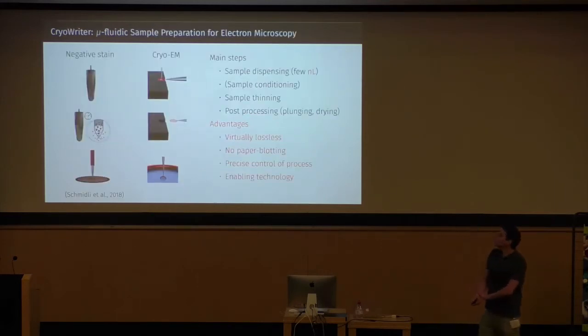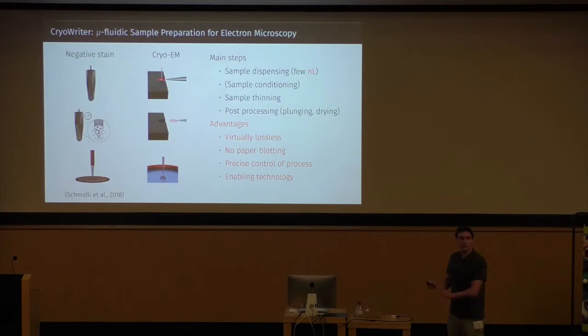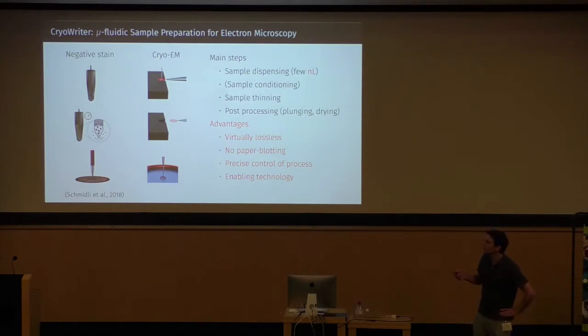Now to the details of the different modules. First to negative stain and cryo. So there are some major differences between our method and the classical sample preparation methods you all know. So first we are using much smaller sample volumes. So usually for a grid we use between 5 and 20 nanoliters of sample. And as well we are virtually lossless, meaning that we have no paper blotting step included in our procedure for making a grid.